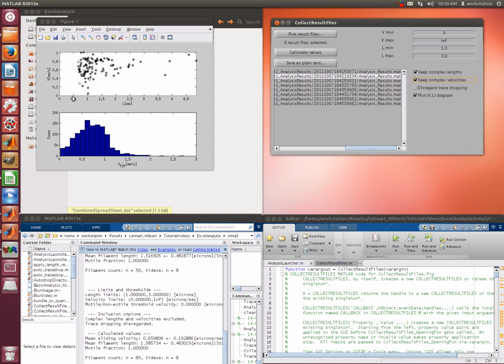So you can say that anything that shows up as longer on the axis would actually be a longer object in the assay. What you cannot say anymore is that it's at exactly 0.5 microns or at 0.4, but the absolute length values are not really reliable that much anymore. So all you can really draw from here are relative conclusions, like a filament is longer than another filament.